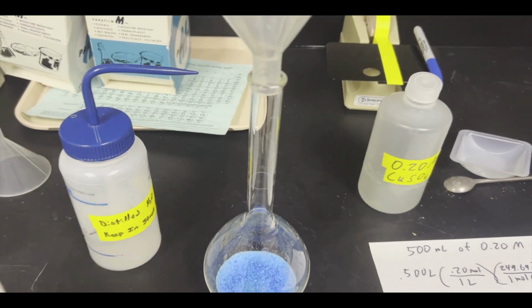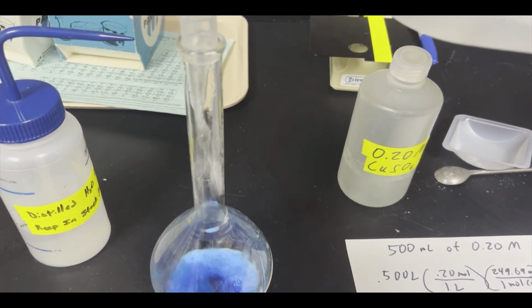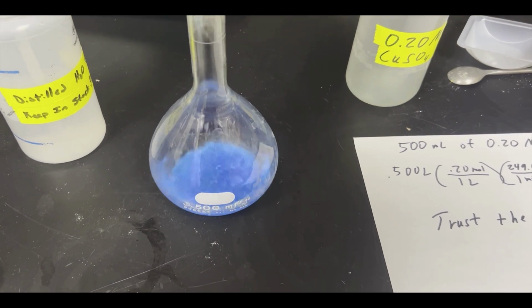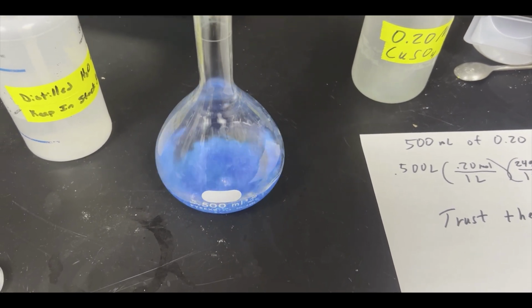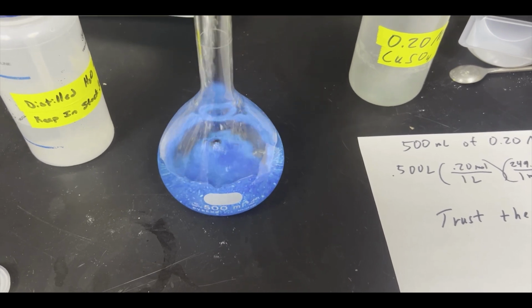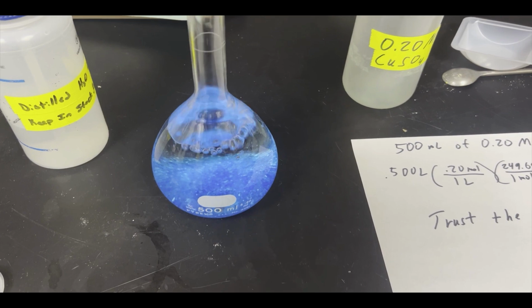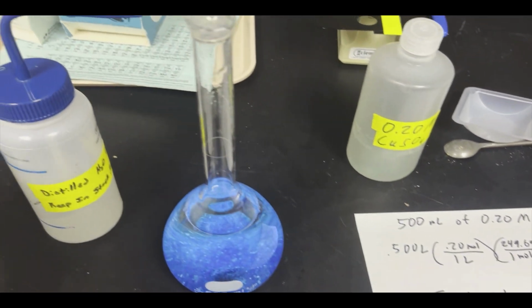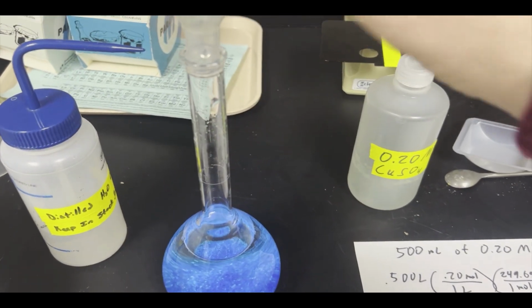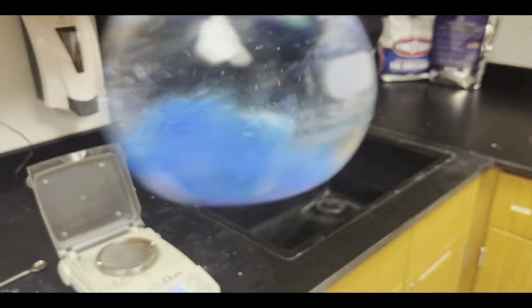So we're going to start with our distilled water, and I'm going to start by just pouring a decent amount of distilled water in. I'm not going to fill the flask completely full at the start because I want to dissolve that copper sulfate first. I am going to fill it full enough where I have enough volume so I am going to be able to get that to all dissolve, okay? So by doing that, here's my solid. I have to dissolve this first. So I'm just going to swirl it.